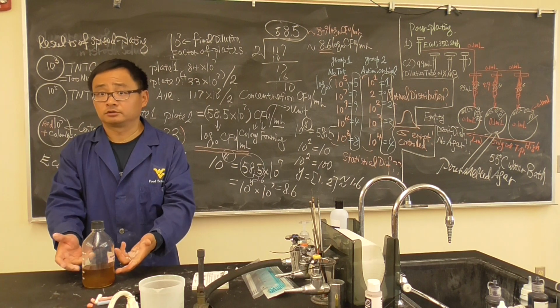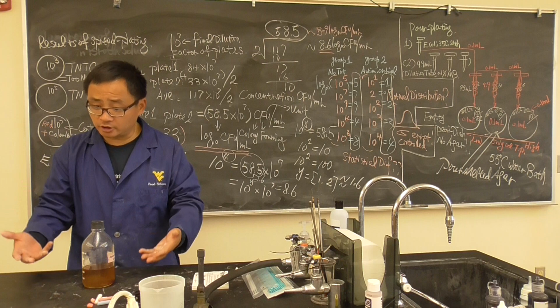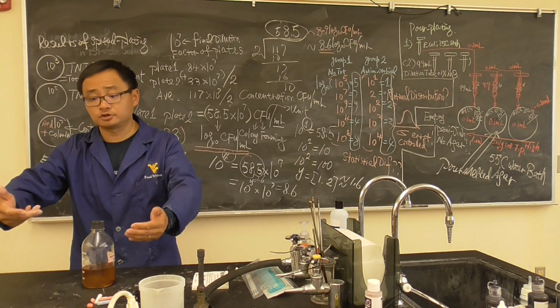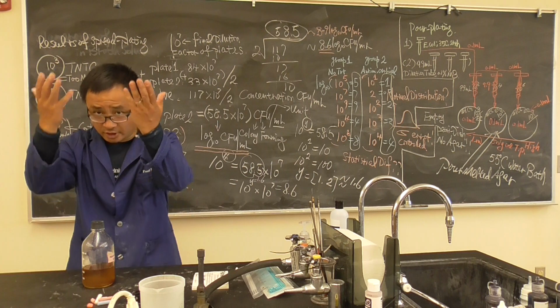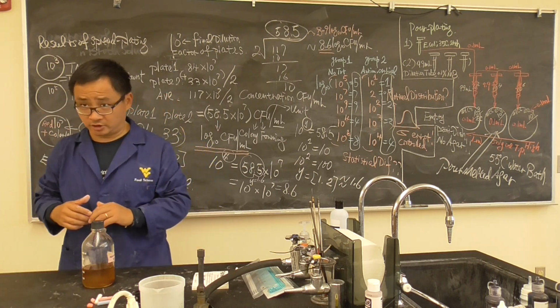This is like a pudding. Remember, we talked about that, like when you make a pudding at home. It will solidify very soon. But don't flip it over, because you just made it. Usually you need to wait 24 hours, then you flip it over. We will just let them stay on top. Put them in the incubator, and you can count on Thursday.